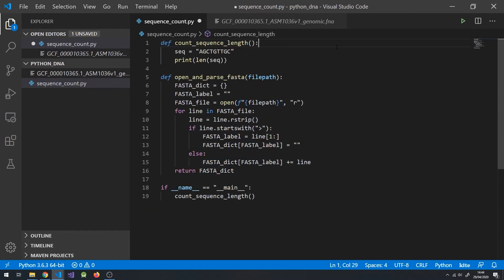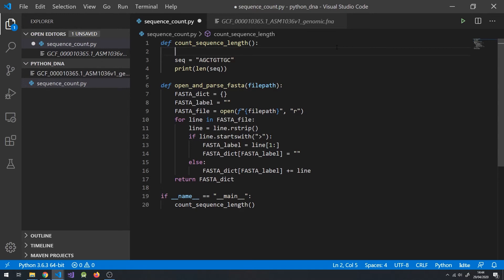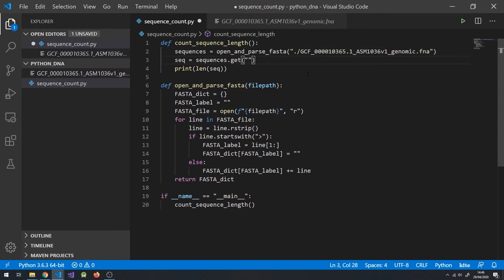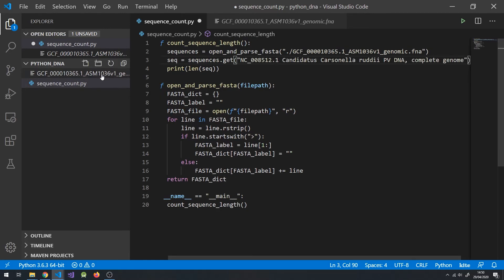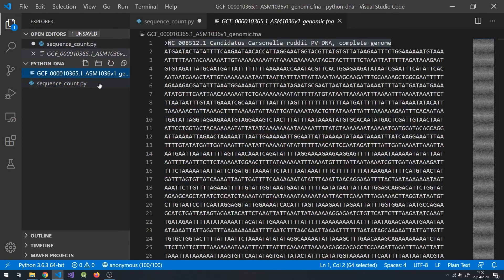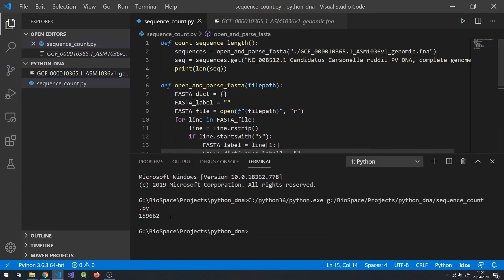Let's see if this works by counting the length of our bacterium's DNA sequence. First, let's call our new function and set the output as sequences. Now let's get our sequence by accessing it under our sequences dictionary, under the label of choice, which can be found in your FASTA file. Run your code and you should get some results. This bacterium has one of the smallest genomes in the world.